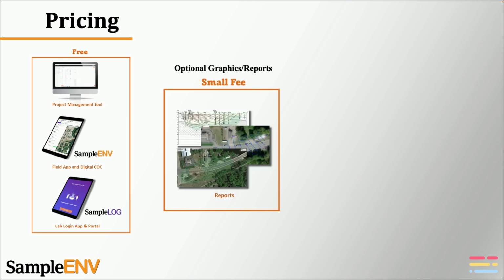We do charge a small fee for the graphics reporting package. Again, the reporting package is optional, it's not required. About 95% of our users decide to opt into the reporting because of the value provided and the quality of the reports. Our fee structure is based on the amount of usage. It's typically called, in the software industry, a metered subscription model. Fees are calculated based on the volume of samples and field data collected and only charged if you opt into the reporting feature subscription.